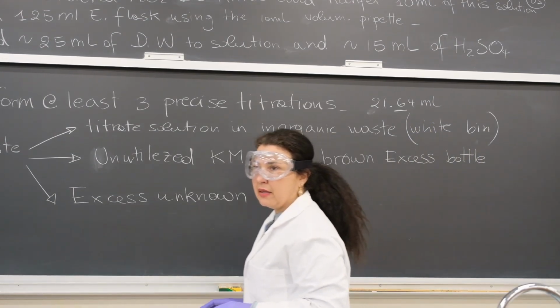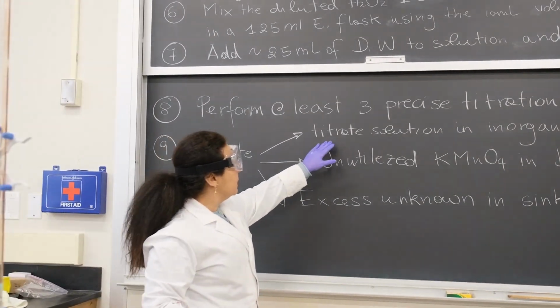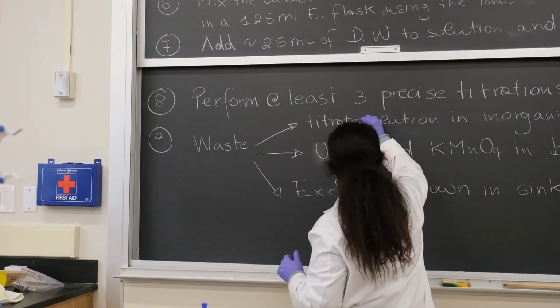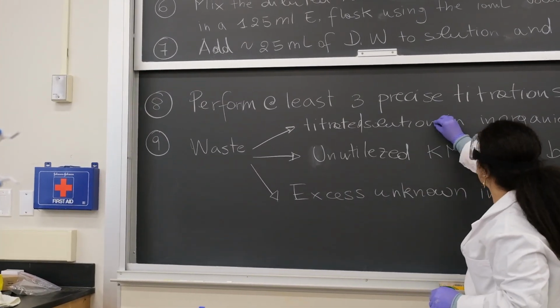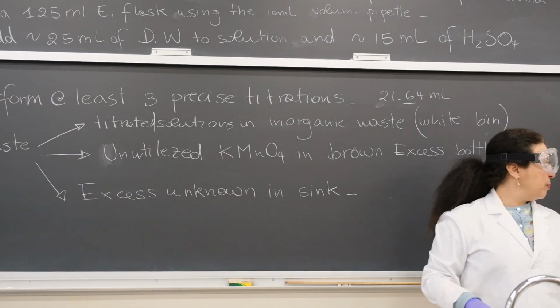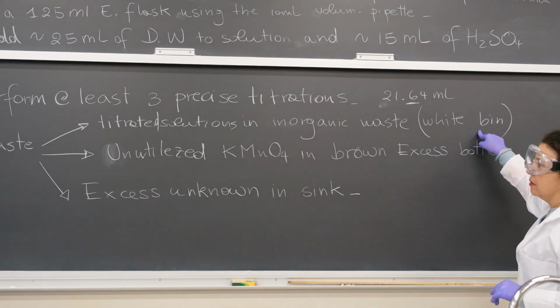Once you're done, the titrated solutions go in the inorganic waste. You know where it is, the white bin.